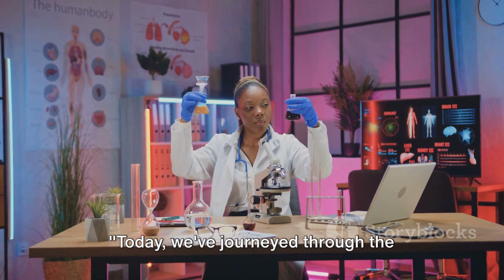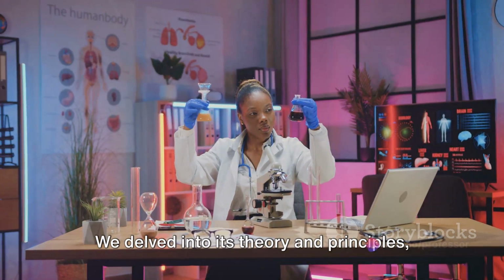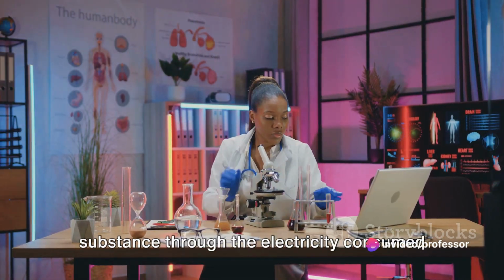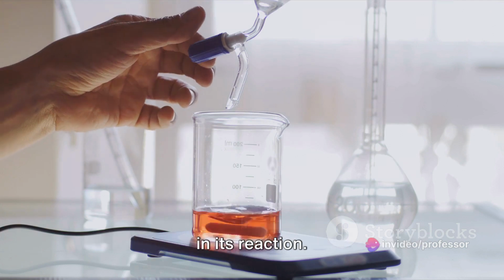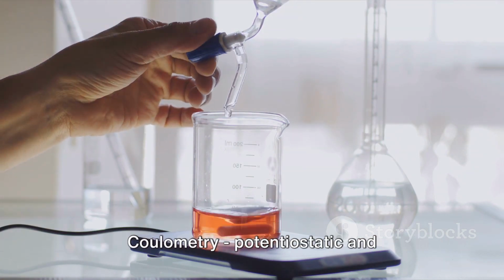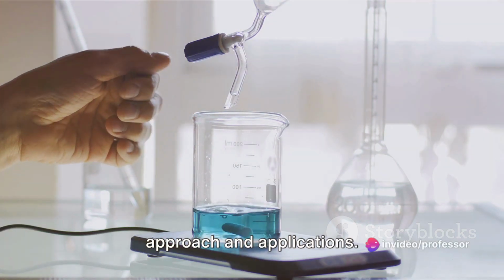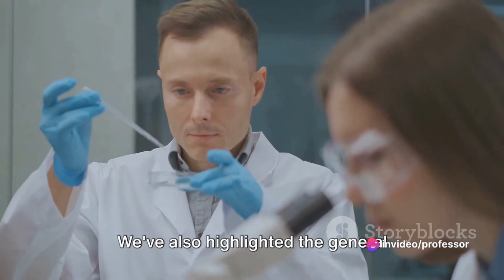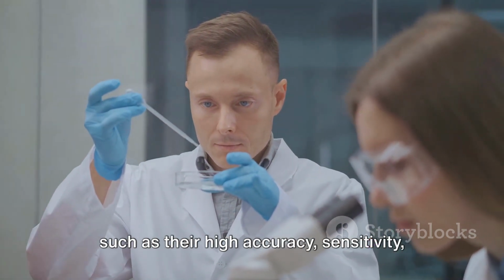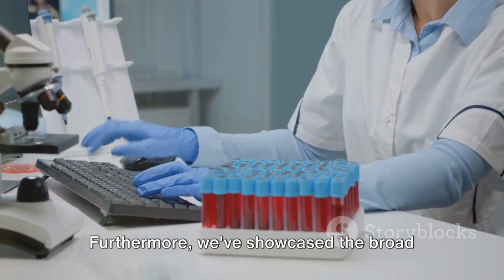Today, we've journeyed through the intriguing world of coulometry. We delved into its theory and principles, exploring how this electrochemical technique measures the amount of a substance through the electricity consumed in its reaction. We've differentiated between the types of coulometry, potentiostatic and amperostatic, each with its unique approach and applications. We've also highlighted the general characteristics of coulometric techniques, such as their high accuracy, sensitivity, and ability to analyze small sample sizes.